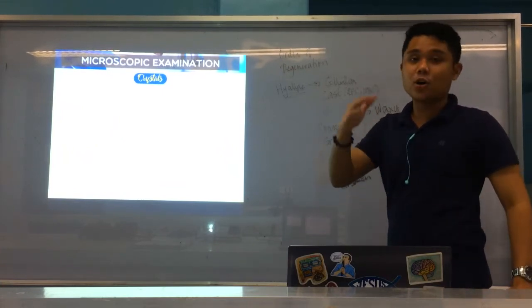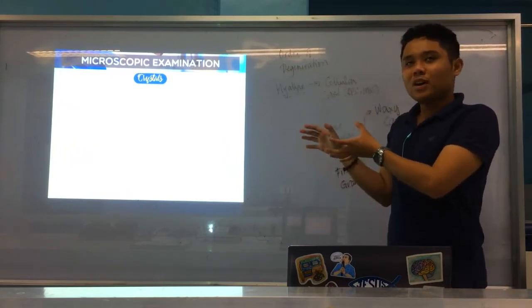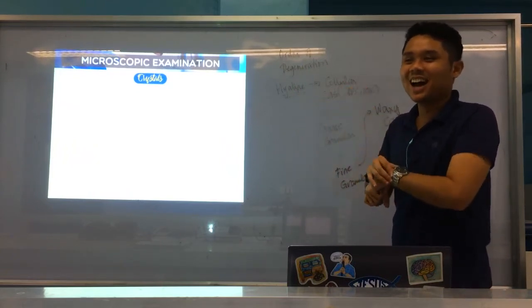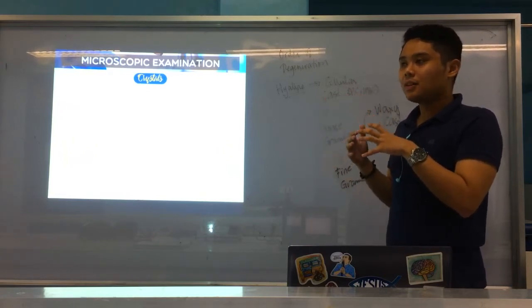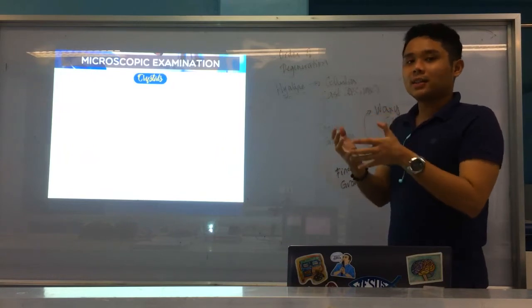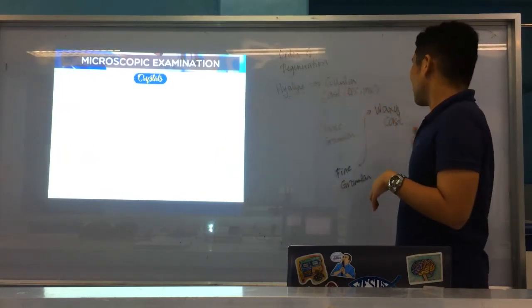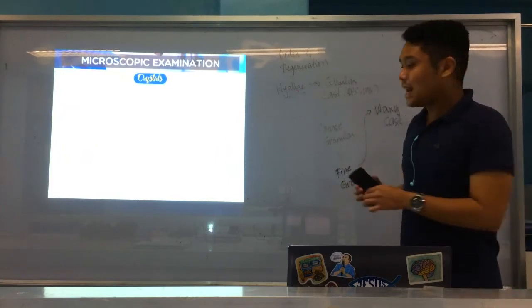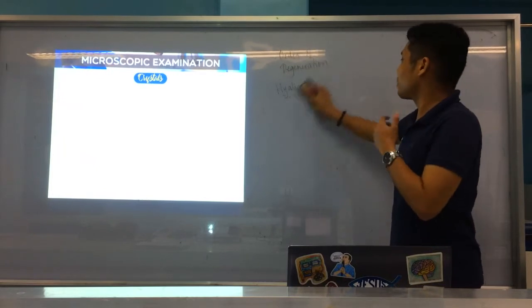So that's the order of degeneration. Degeneration meaning the order of the life cycle, in a way, of a cast, or the different types of cast that are created over a period of time. But starting with hyaline, the very last is waxy. And one last thing, these are just additional points that I only remember now, sorry.